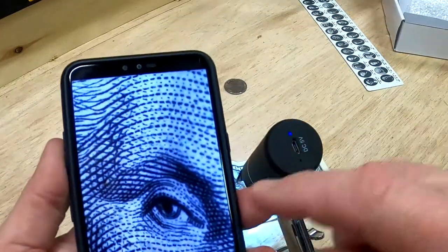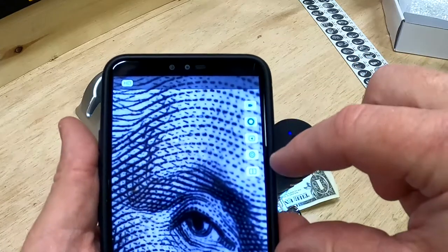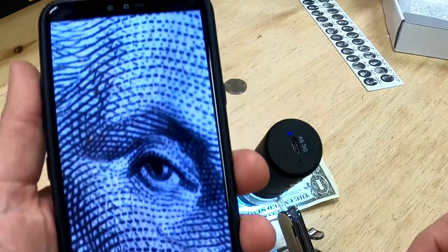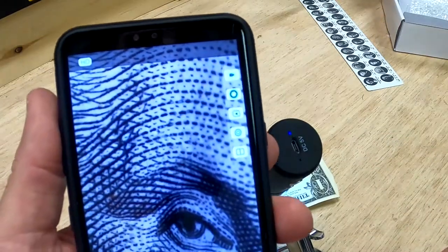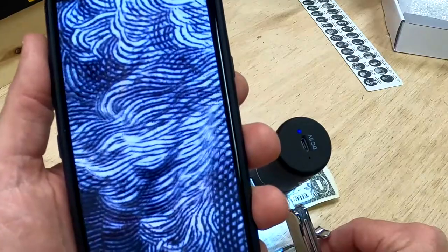Let's talk about the app for a second. With it you can take video or take a picture — just click that icon. You can download the ISCAM app even without the microscope if you want to try it. There's a lot to look at in the microscopic world with this thing.